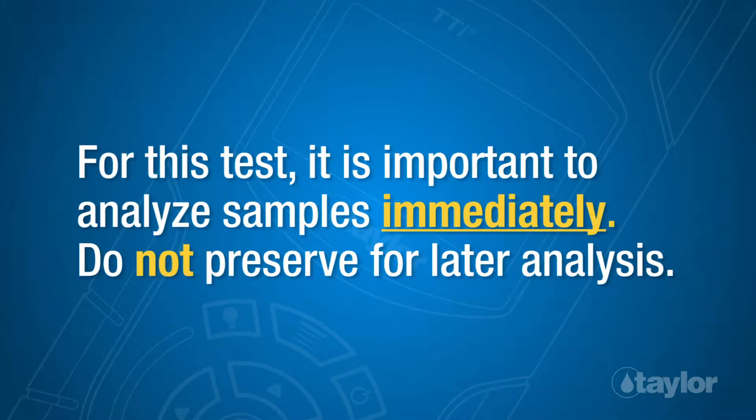Note: For this test, it is important to analyze samples immediately. Do not preserve for later analysis.